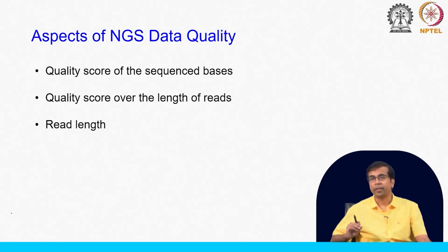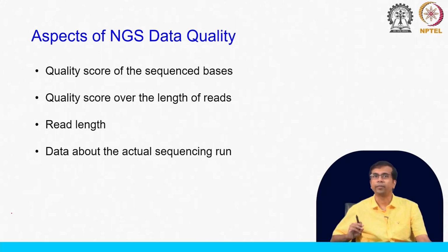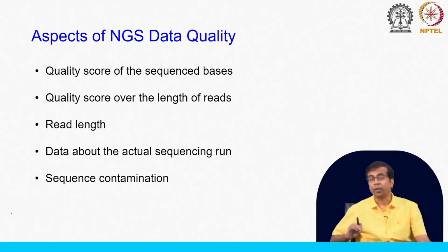And then there are also other aspects, for example read length. You have the data about the actual sequencing run, how the sequencing went, and some statistics will be gathered, such as whether there is some sort of contamination.